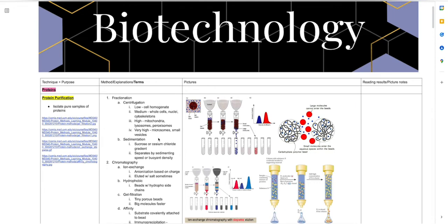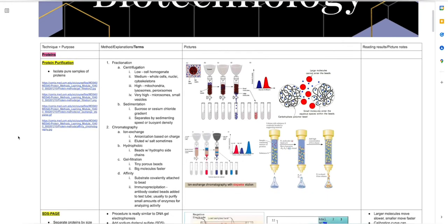And yeah, so for sedimentation, you can do this with a gradient in a solution, and how fast the particles settle or where they end up lying in the solution can separate them. So ideally what you would get out of this entire step is a mixture of your desired protein and some other similar particles. So to further separate your solution, you could use column chromatography.